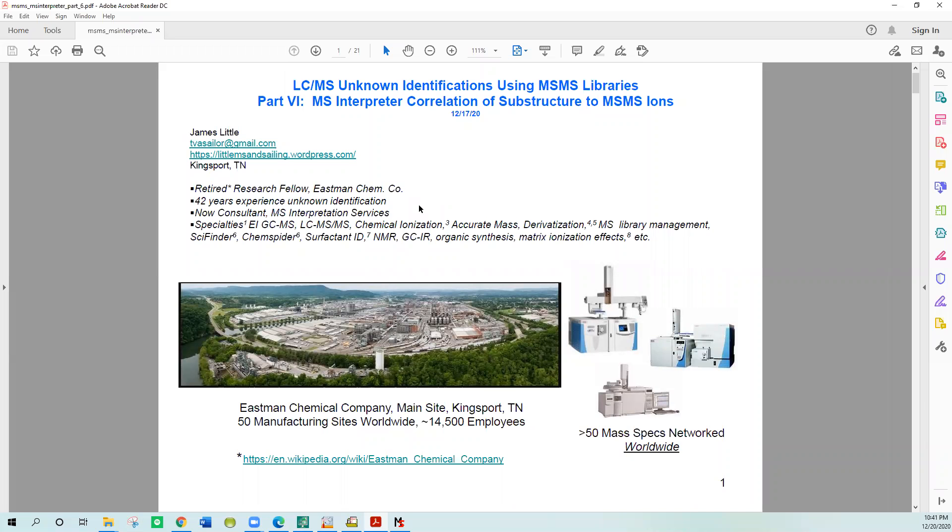Good evening, tonight I would like to share with you part six of this LC-MS Unknown Identifications Using MS-MS Libraries series that I have been presenting over the last week or so. Part six is on the MS Interpreter correlation of substructure to MS-MS ions.